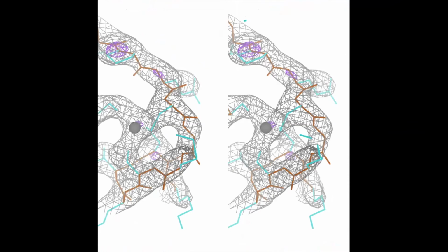And if you know they're there and more or less where they are in the sequence, then they're not much of a problem. If you start to model them in, you can do quite well. But if you have a site in your structure that you didn't know about, then you can get real problems. So this is a zinc site, a 4-cysteine zinc site, nice tetrahedral cysteine links.